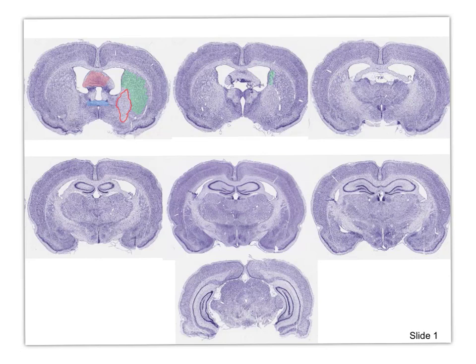this is still caudate, lateral to the lateral ventricle, and we have a nice globus pallidus. This is the anterior nucleus of the thalamus. This is still fornix here.